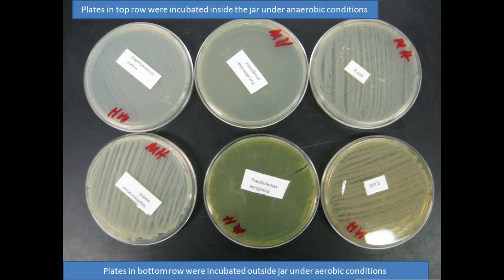So this is the experiment that we did, all right? And again, we didn't have any Clostridium sporogenes because it's really hard to grow anaerobically.